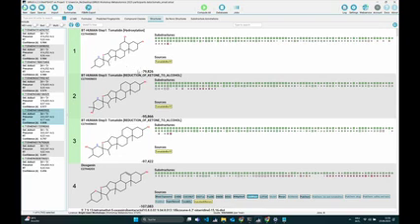If you look at this a little more closely, you will see that these structures resemble one another quite a lot. The only thing that is changed is the hydroxide group, which is at different parts of the structure. The interesting thing is that these 3 hits we can only find in our tomatidine biotransformer custom database, so these are not included in any kind of public database.